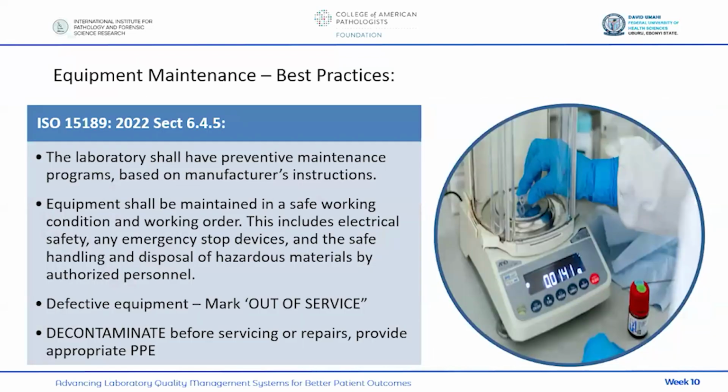So our ISO 15189:2022 section 6.4.5 has provisions for equipment maintenance. And it says that the lab shall have preventive maintenance programs based on manufacturer's instructions, and that the equipment shall be maintained in a safe working condition and working order.